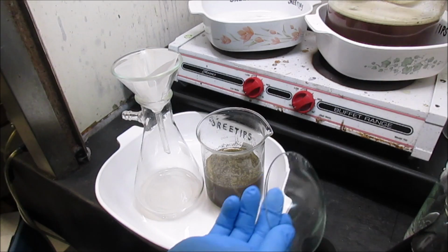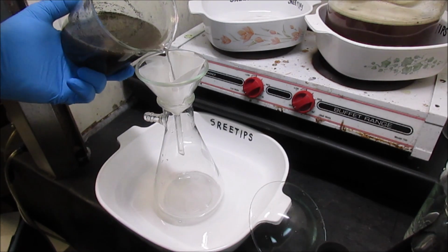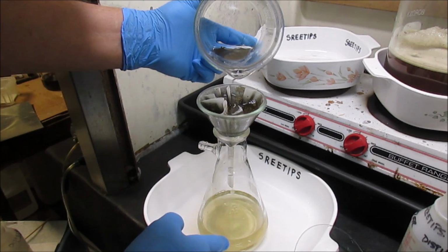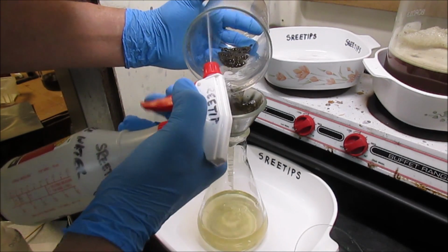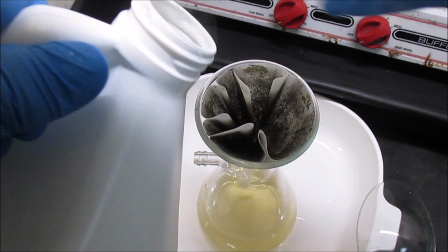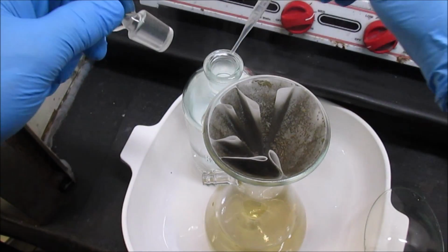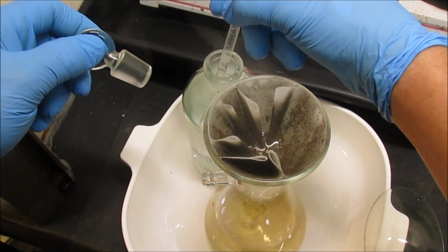Alright, here we go. I'm going to filter it again. Junk in here or something. You can see the filtrate is an amber color. So I'm going to go ahead and dissolve this one more time. Hit it with a little hydrochloric acid here, rinse it out. Rinse this out a little bit with some more hydrochloric acid. Evidently some junk got in there.